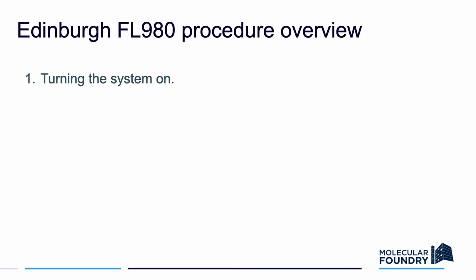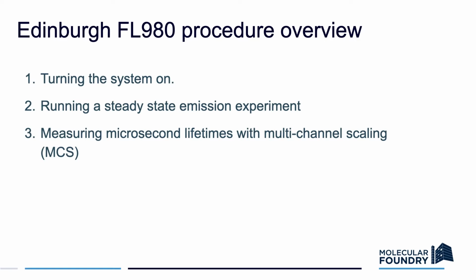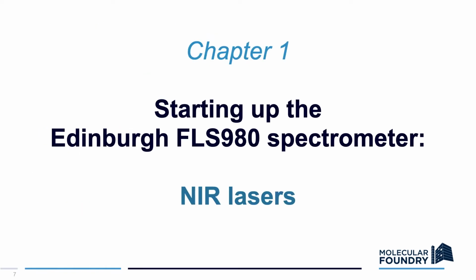So we'll cover today turning the system on, running steady-state emission experiments, measuring microsecond lifetimes using multi-channel scaling, shutting down the instrument, and troubleshooting. Chapter 1.